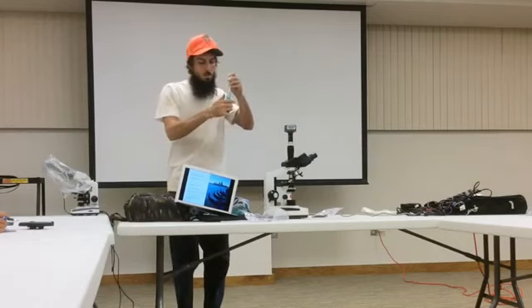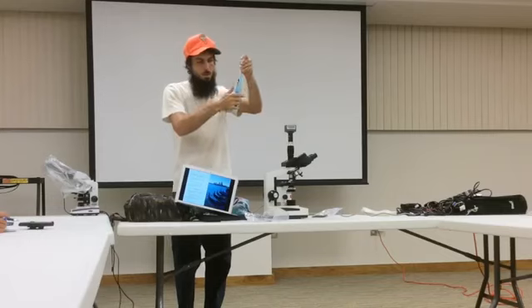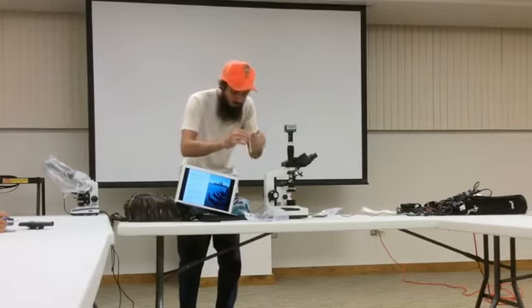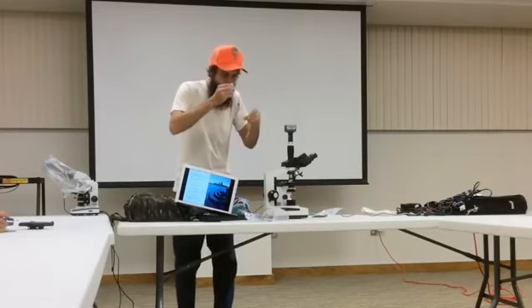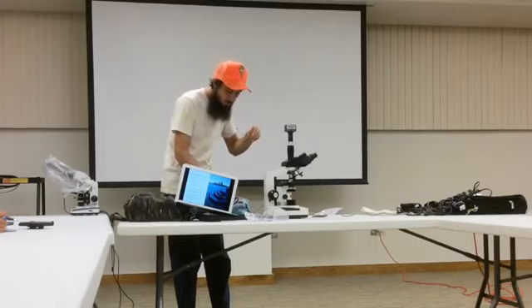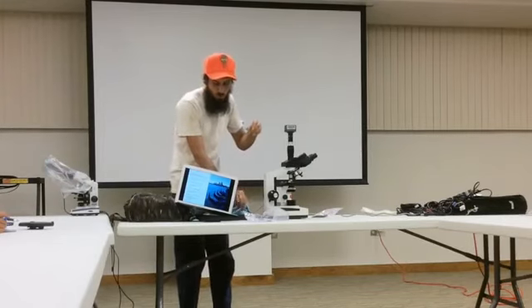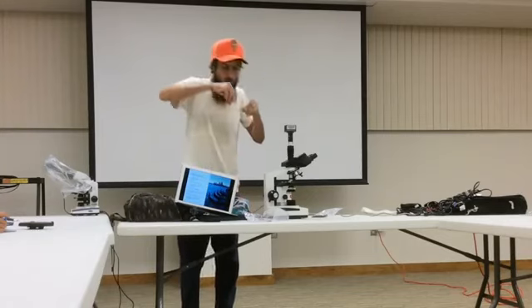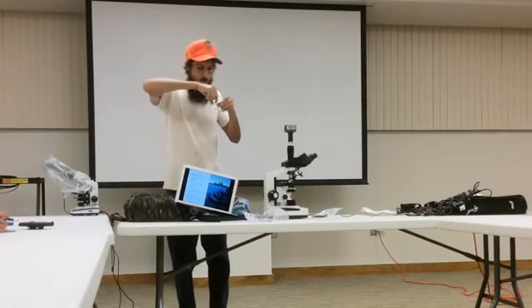And then once I'm satisfied with that, I take just a drop. Drop that onto my slide. And you can do either 1 or 2 drops, depending, just be consistent with it. And then take my cover slip and I put that on the top.